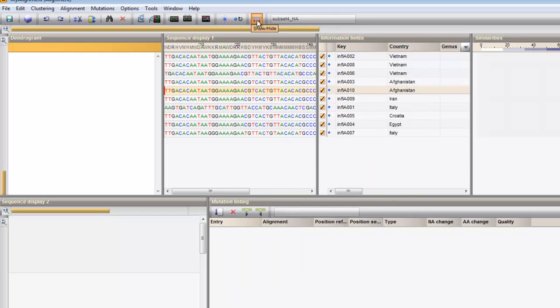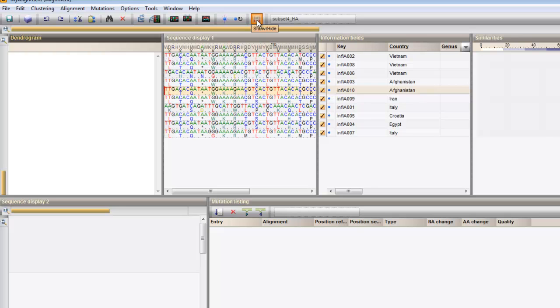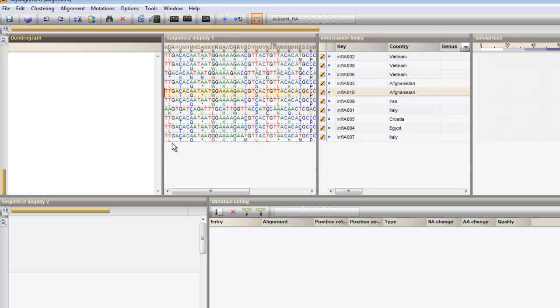Press this button to toggle between the nucleic acid sequence view and the translated amino acid sequence view. The zoom slider on the left can help to optimize the display of both nucleic acid and amino acids.